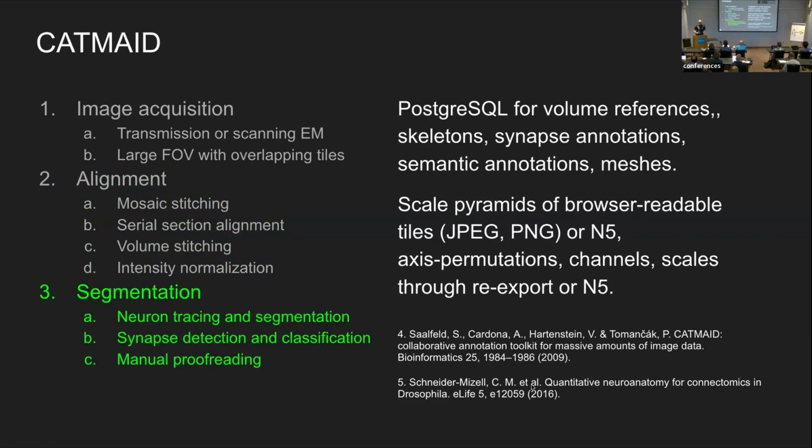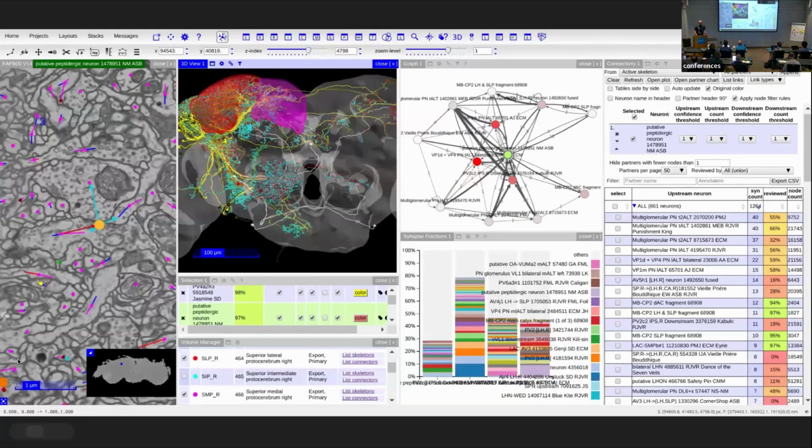And then colleagues at Janelia, Albert Cardona and Stephan Saalfeld, implemented all the skeleton tracing tools and graph analysis. It started just as a visualization tool, and it became this massive workbench that supports everything that is skeleton-based connectomics analysis. Here's a screenshot of CATMAID, the smallest part with the viewer. That's the stuff that I wrote at some point. Then it's all the rest, the super complex, and includes the 3D viewer and all sorts of stuff.